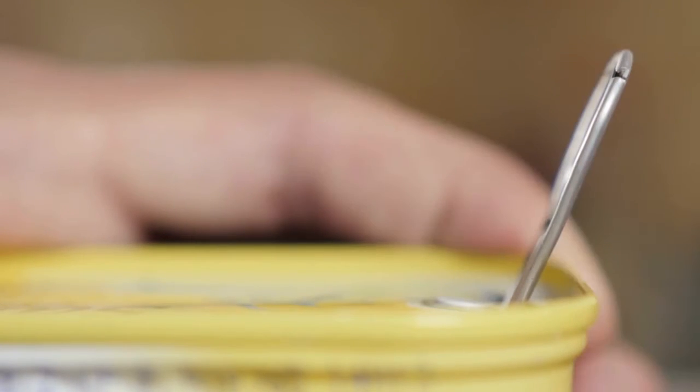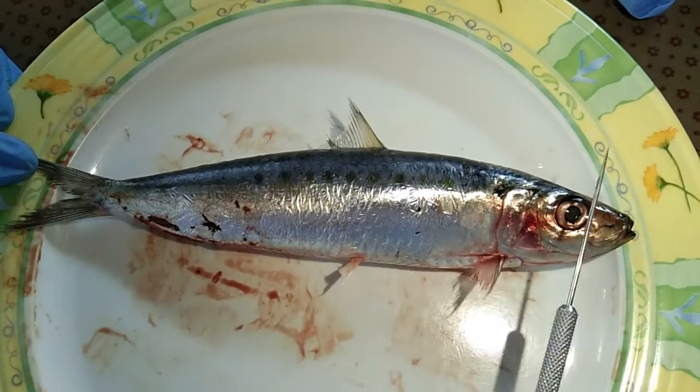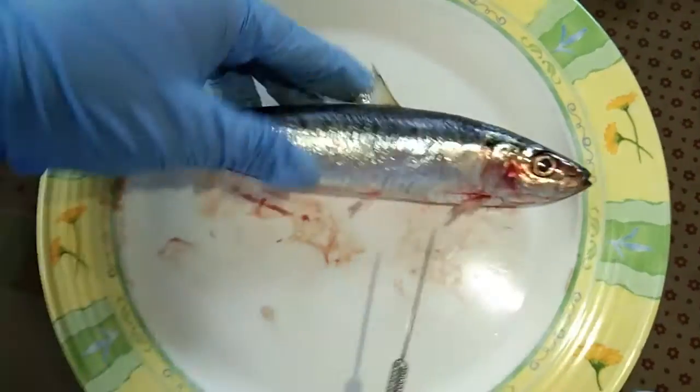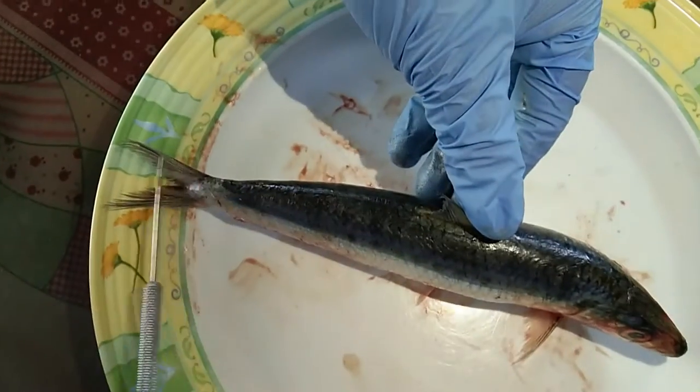It is the second most abundant sardine occurring in the Philippines. In exploring the anatomical features of the sardine, start by identifying the external parts by examining the fish on its lateral, dorsal, and ventral sides.